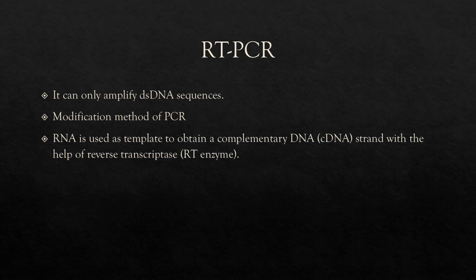So what is RT-PCR? RT-PCR stands for reverse transcriptase PCR. Here the RNA is used as a template to obtain the complementary DNA strand with the help of reverse transcriptase, that is the RT enzyme. This is a modification of the PCR method and it can only amplify double-stranded DNA sequences.